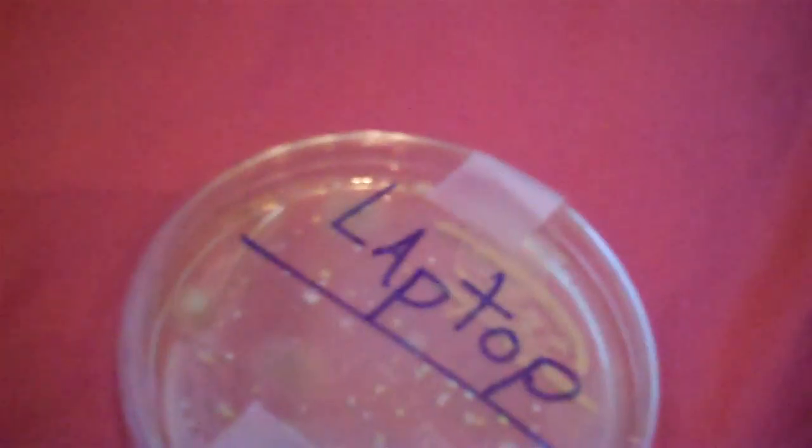On the laptop, there is a lot of bacteria growth — a ton. I don't know if it was in great conditions, but look at this: a big organism there, and big ones there, there, there, and there.